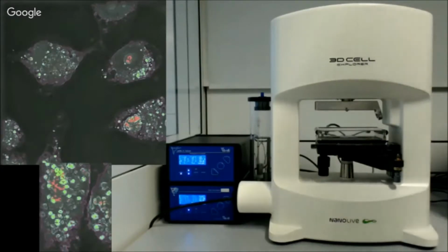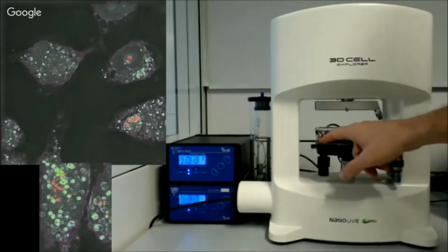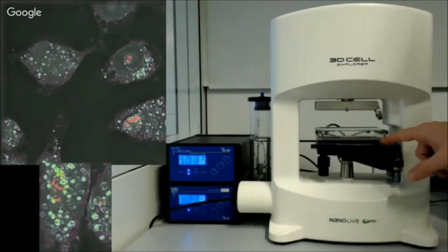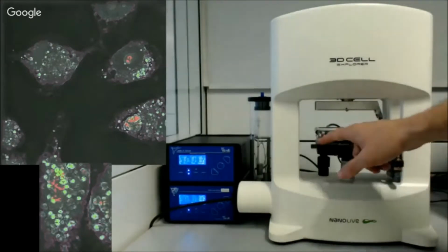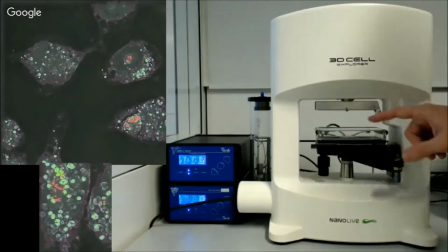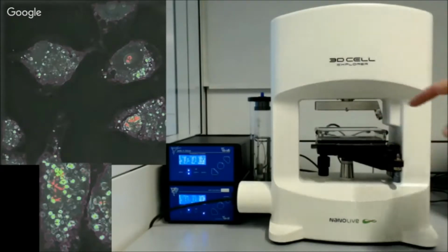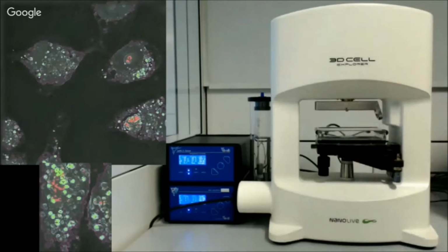A very nice feature of this incubator is that you can very precisely control the temperature of the plate and the temperature of the lid. This means that you can set a very small gradient, say 37 degrees and 2 degrees more here, so that you avoid the formation of moisture on the lid, and you can really carry on with many hours, say days or even weeks of experiment.